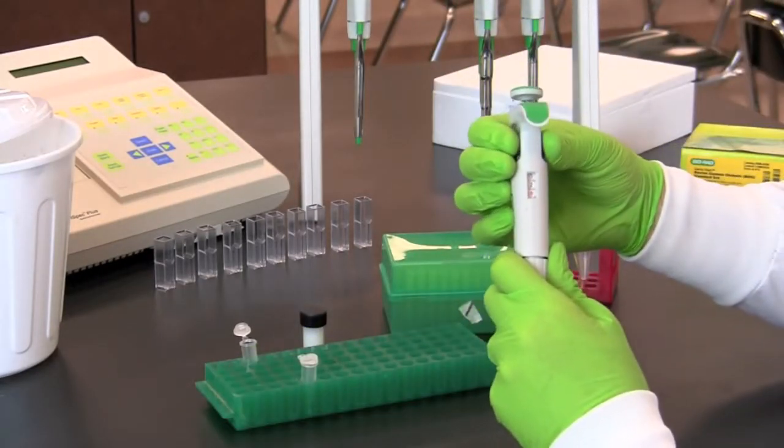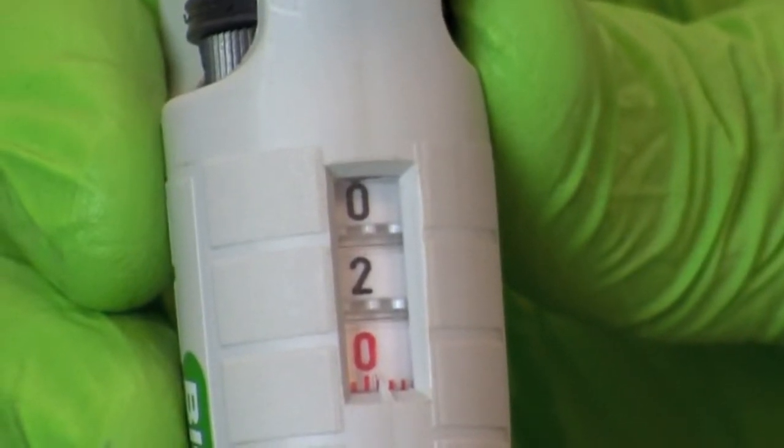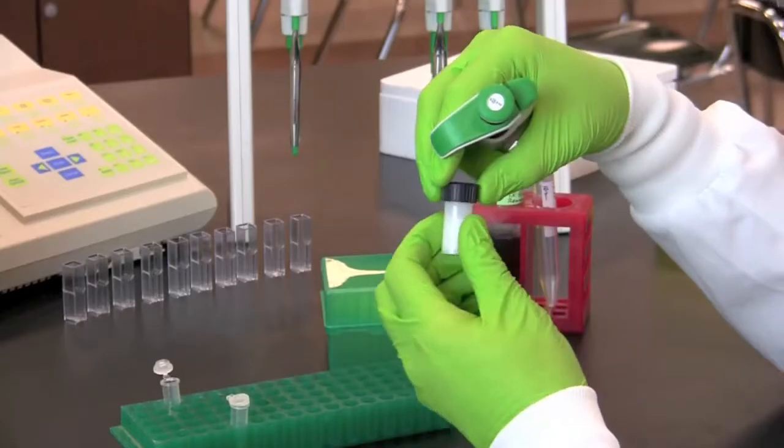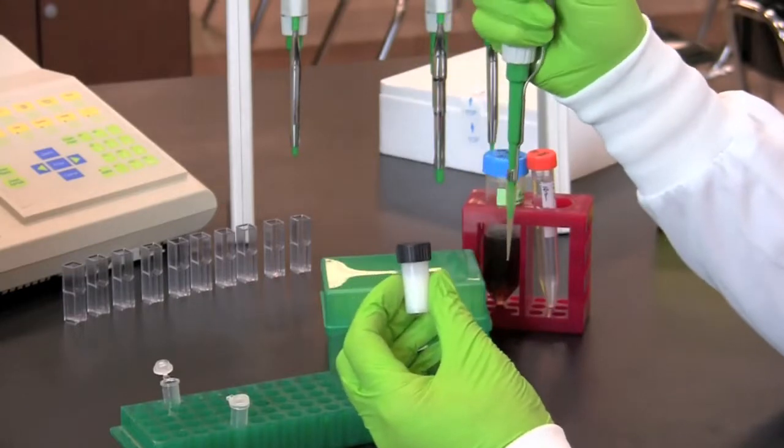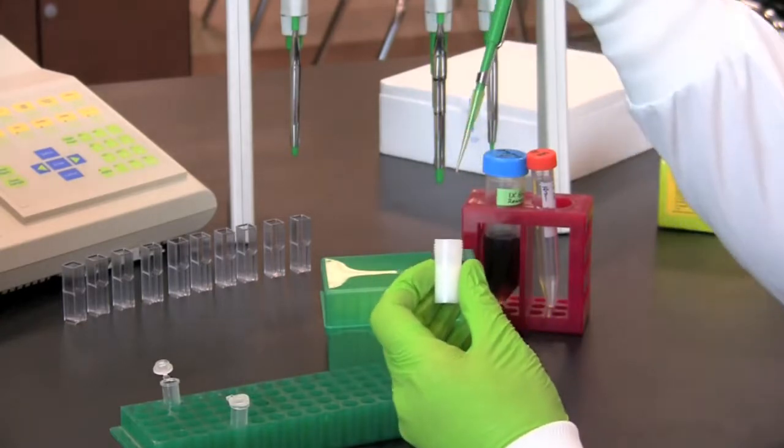Switch to a 2 to 20 microliter micropipette and set the pipette to 2 microliters. Pipette 2 microliters of milk sample into the microtube labeled sample.